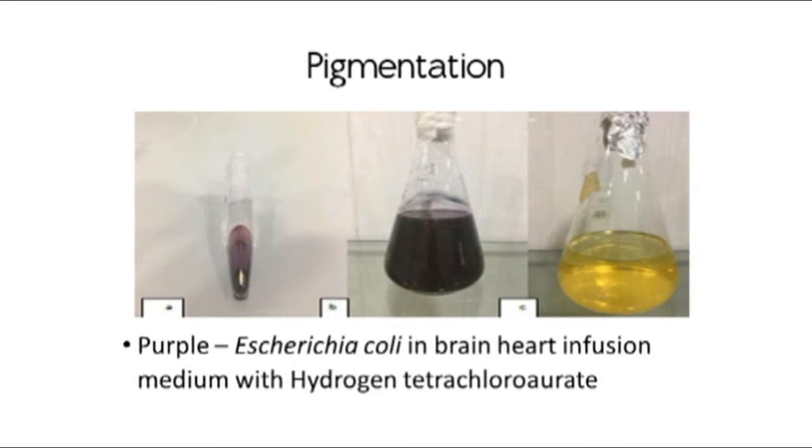Some bacteria change the pigmentation of the medium. Escherichia coli in brain heart infusion medium with hydrogen tetrachloroaurate changed the color of the medium into purple.